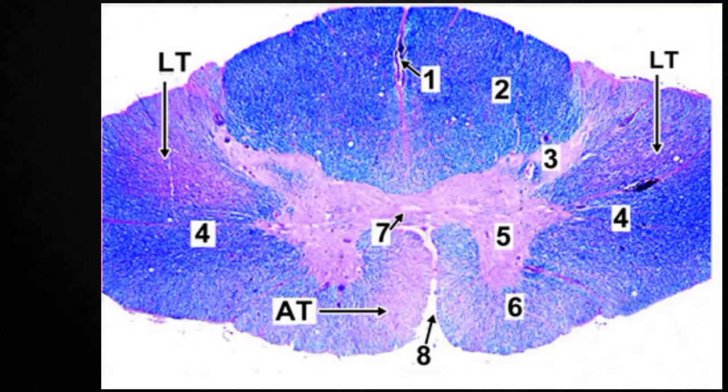Then moving to the spinal cord. How to identify the spinal cord? It is very easy, because the spinal cord slide has been focused in a simple microscope, that is, the dissection microscope. In the dissection microscope, you can identify a clear butterfly-shaped gray matter, that is nothing but the spinal cord.